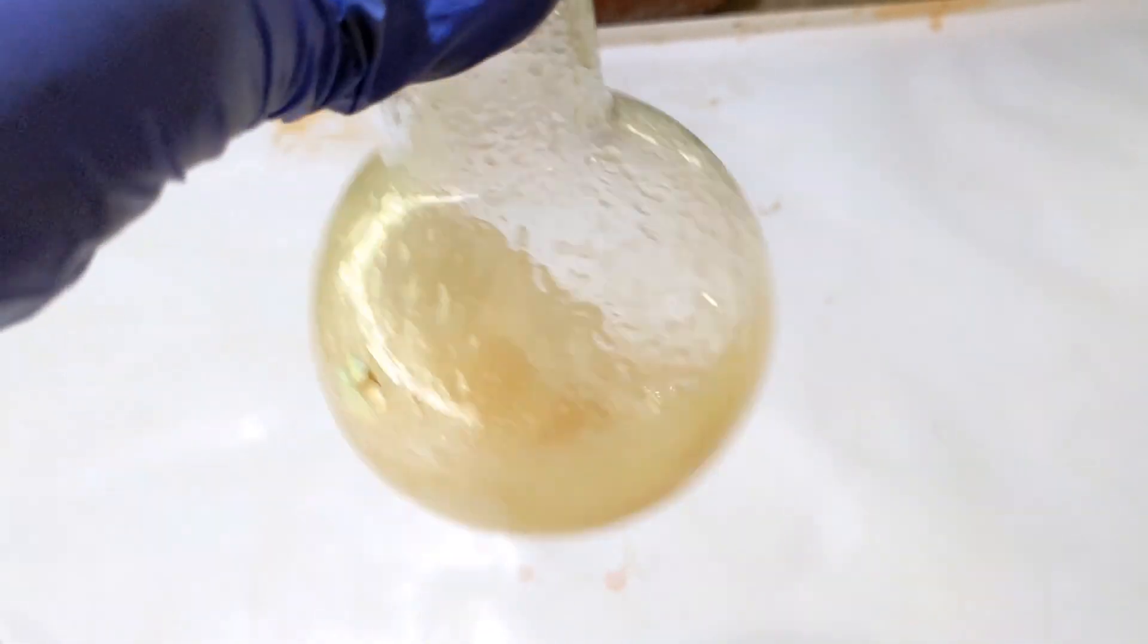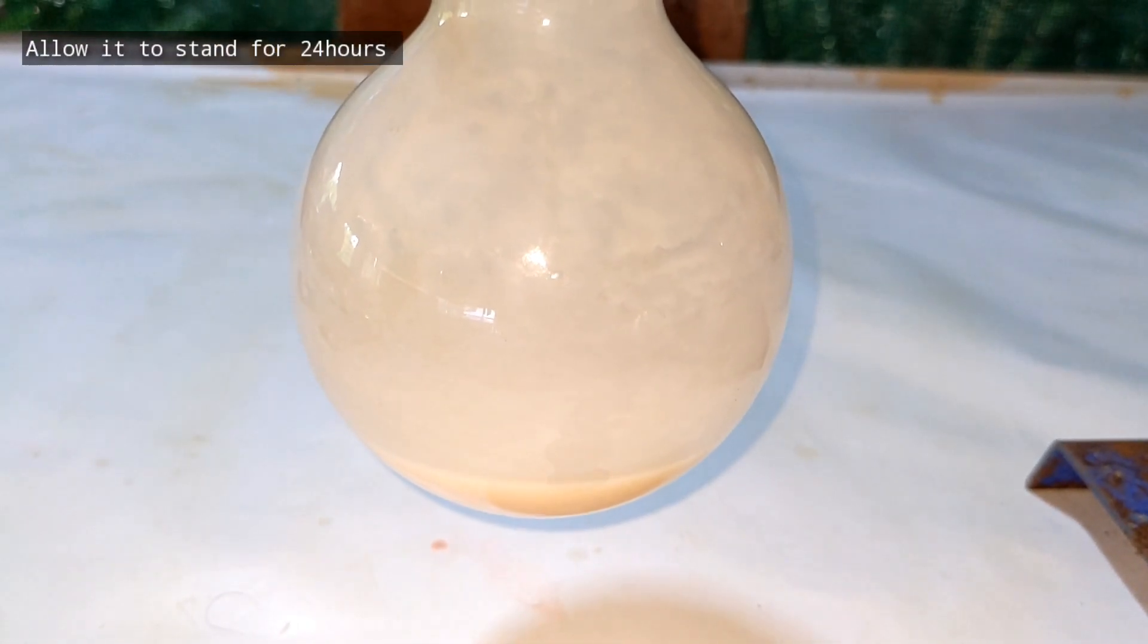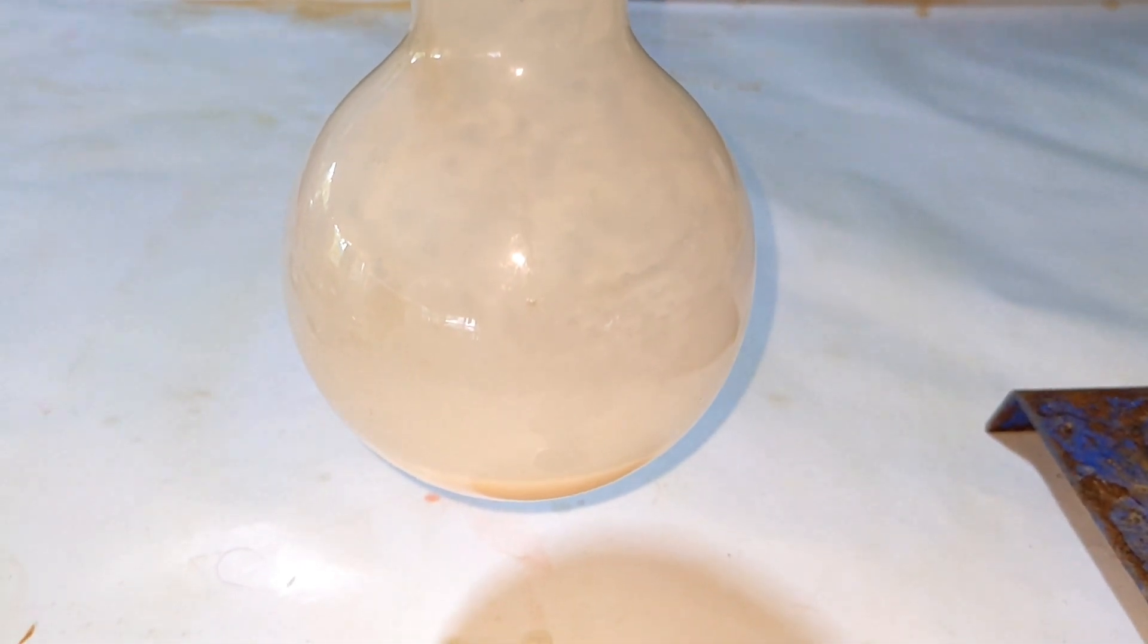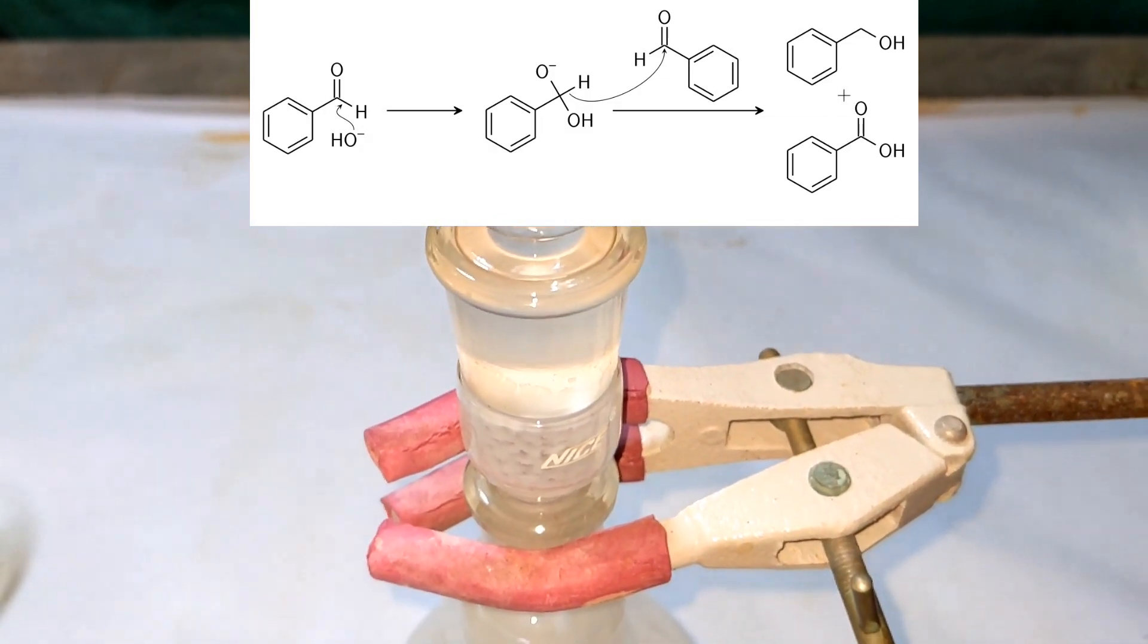Once we have a uniform suspension without any separate layer formation, the flask was kept with the cap on without pressure. It was placed overnight. An exothermic reaction takes place leading to the formation of our desired products.